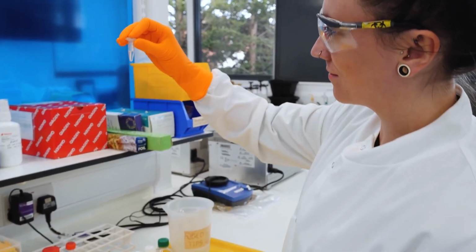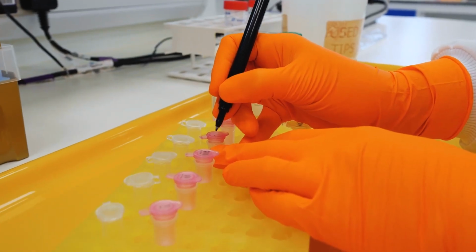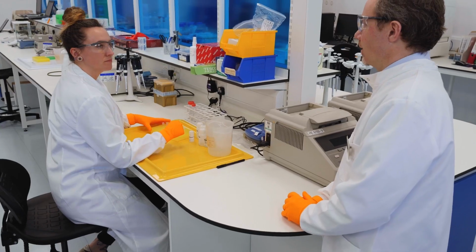When thinking about standardization of nucleic acid measurement, DNA measurement for example, we think about the PCR, we think about the sequencer, but we have to do a large number of procedures to get the DNA into that sequencer. All of these steps can add error or uncertainty. qPCR can get a very precise measurement, but it can be quite challenging to know the accuracy, and it needs calibration. You need to have some kind of standard to which it can be compared.